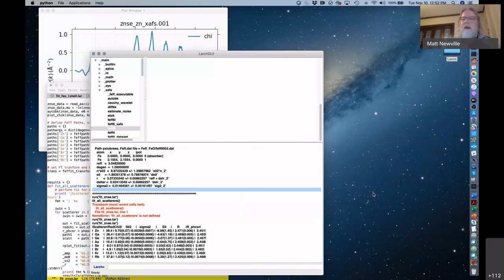And a proper database is often good. You could sort data by beamline or edge or position or sample name. So the known qualities of a proper database can help a lot.